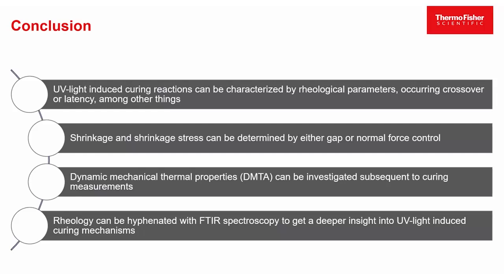As this presentation is now coming to an end, I would like to summarize everything that we discussed so far. First of all, rheology can be used to characterize different parameters like the crossover or the latency of UV light-induced curing mechanisms, but can also be used to investigate shrinkage or shrinkage stresses throughout an actual measurement.